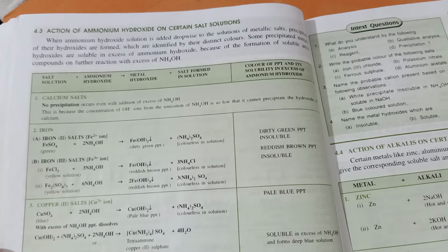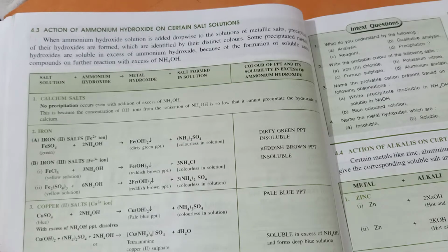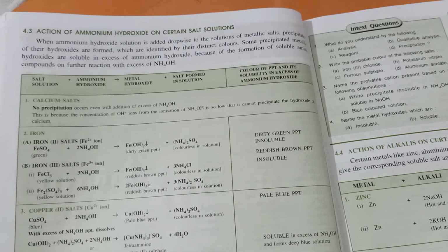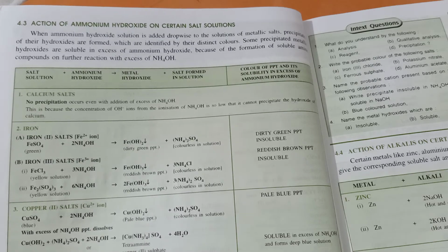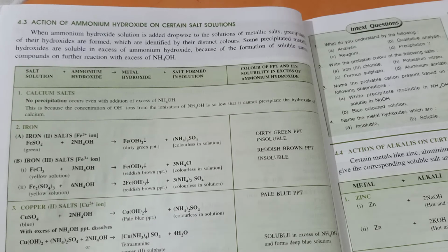Okay, like sodium hydroxide, ammonium hydroxide also has to be added dropwise to the solution of metallic salt. This is done because if we add the alkali rapidly to the metallic salt, then sometimes we might miss the precipitate that gets formed during the reaction.